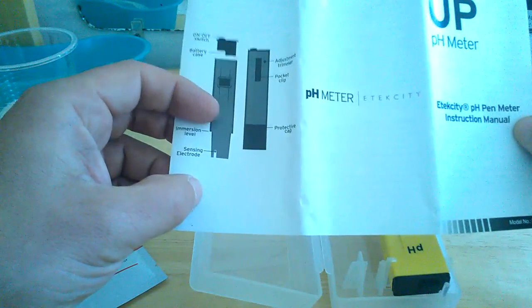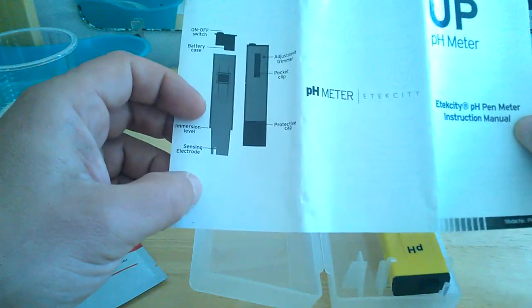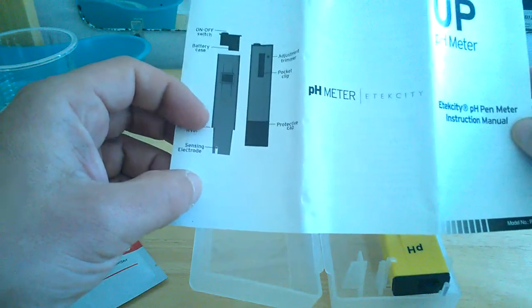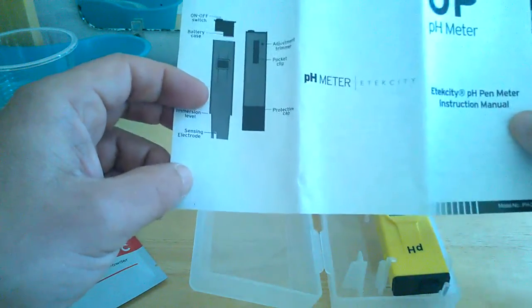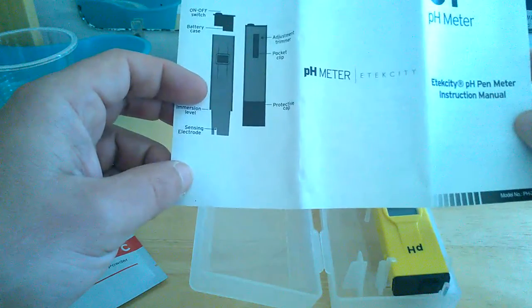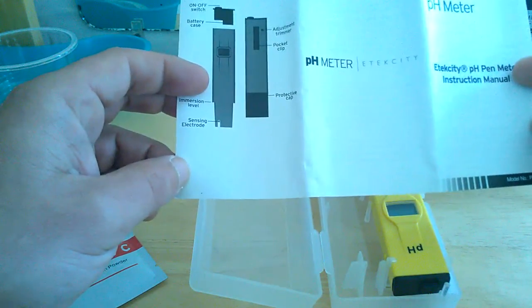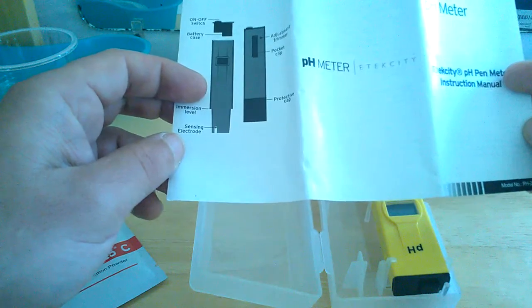You have your immersion level here. I've seen some people immerse almost halfway up the pen. I don't recommend it. Just do what they say here. You don't need to go any deeper as long as the electrode and the sensors are in the fluid that you're testing. You're absolutely fine. And it shows where your sensing electrode is.